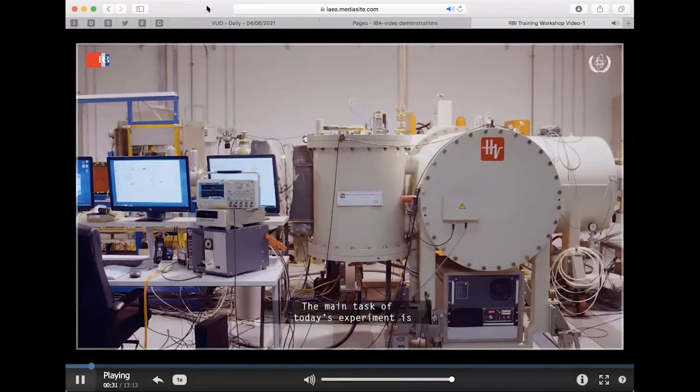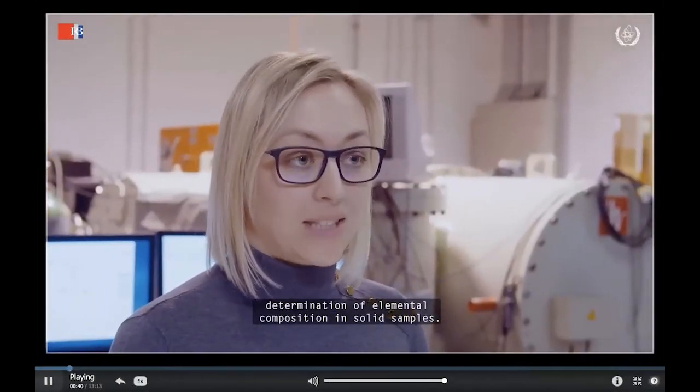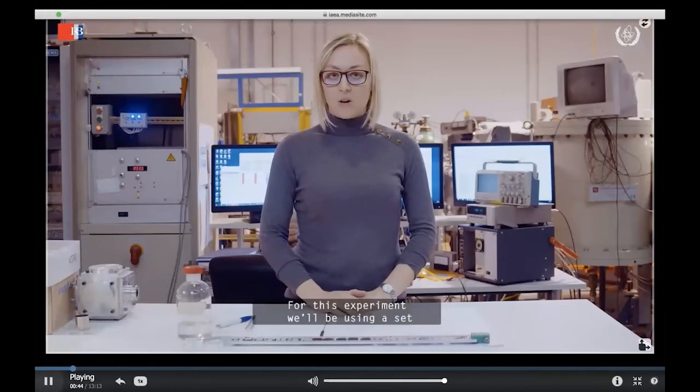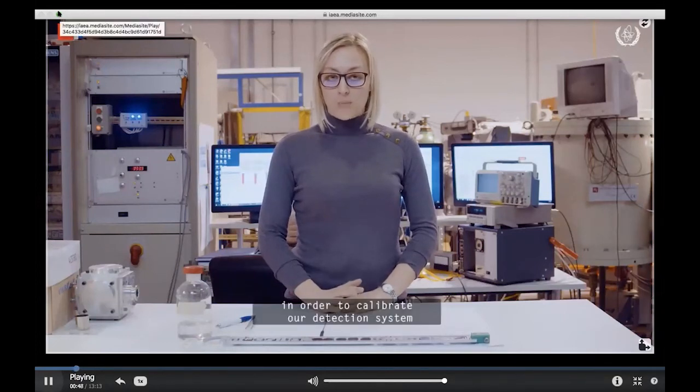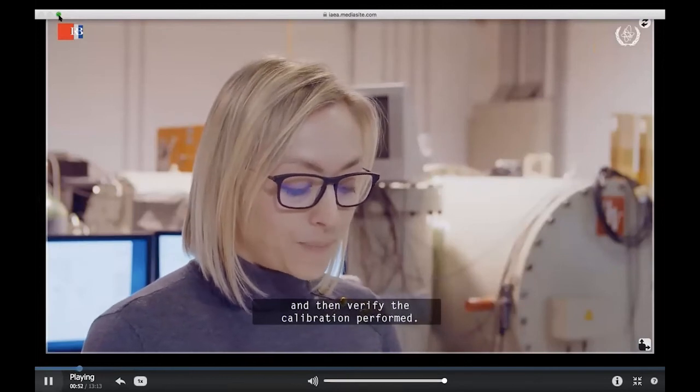The main task of today's experiment is to demonstrate the process of PIXE measurement in determination of elemental composition in solid samples. For this experiment, we'll be using a set of certified reference materials and standards in order to calibrate our detection system and then verify the calibration performed.